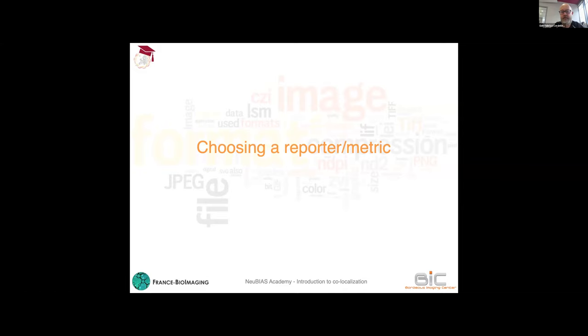But once more, this is personal preference, I do prefer to start co-localization analysis with the data as raw as possible. If you are starting to process and over-process, then you must check that the processing you're putting into the workflow is not adding additional artifacts that will lead to overestimation of the co-localization.